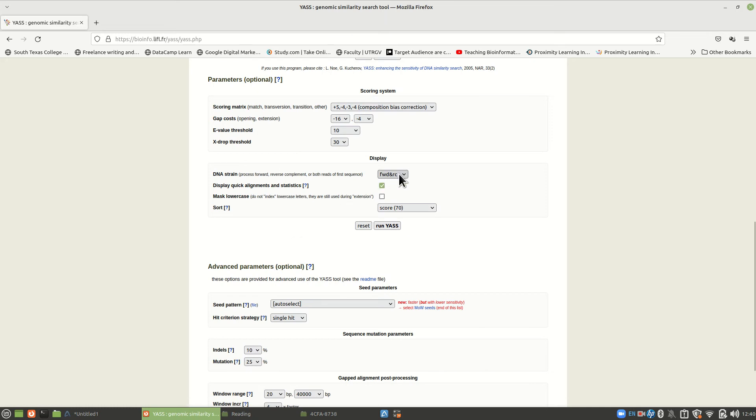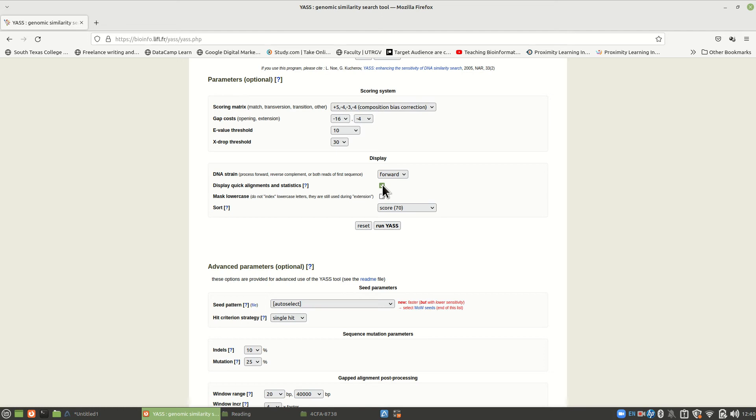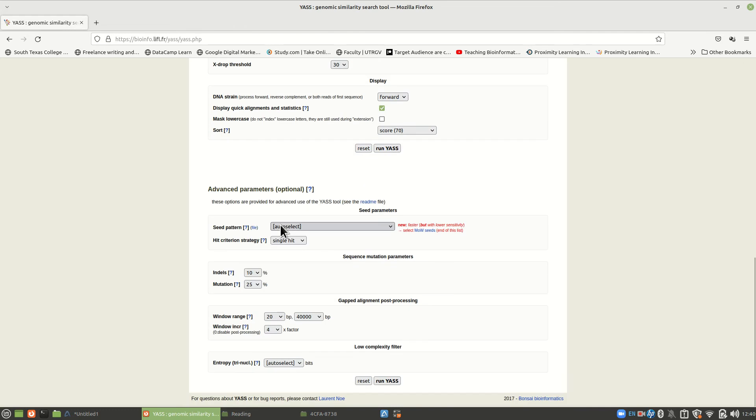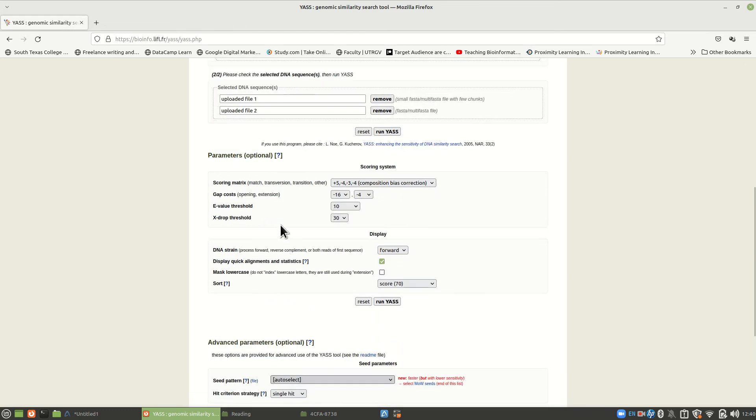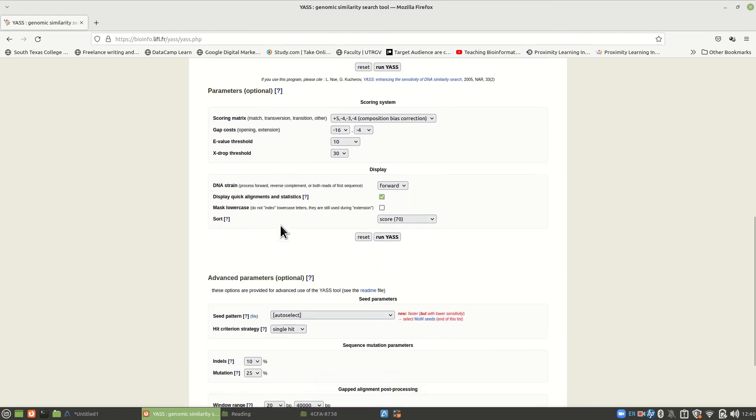Now, this is forward and reversed complement. We don't want them. We really just want the forward. So just click forward at this point. And quick alignment and statistics. We'll leave everything the same. So forward and click the green box if it's not clicked. And then we come down here and we run YASS.